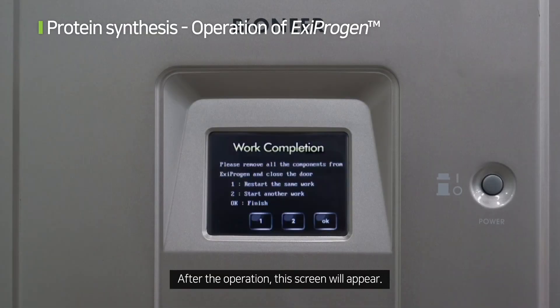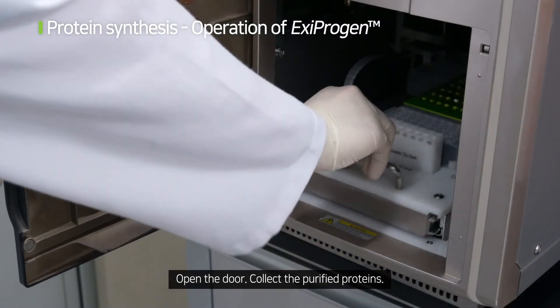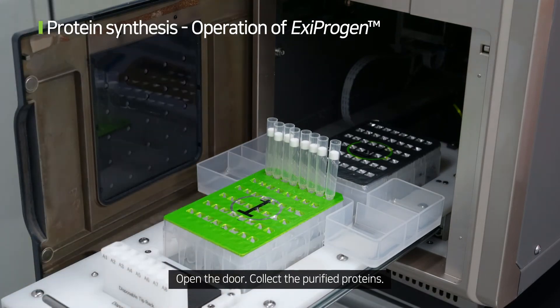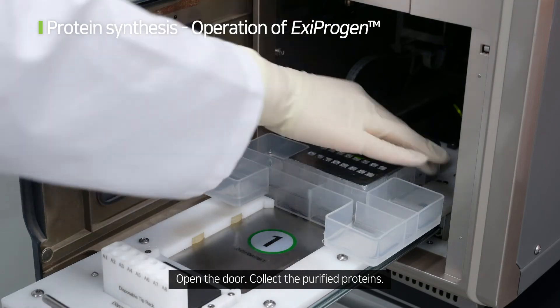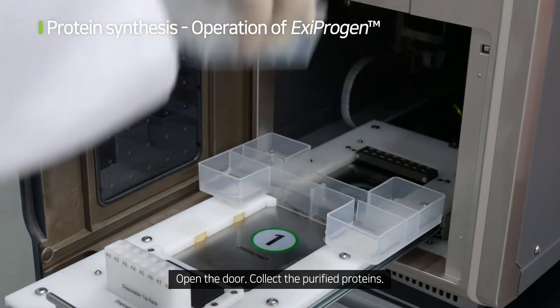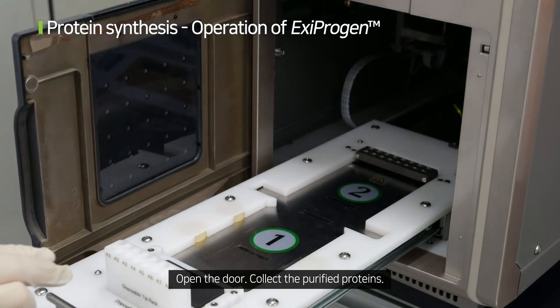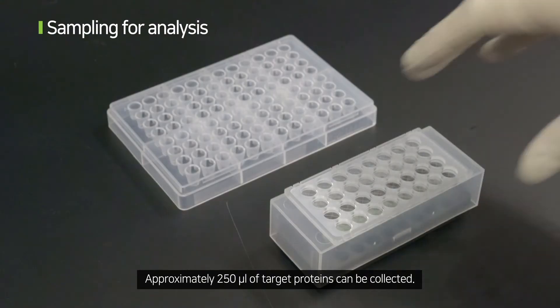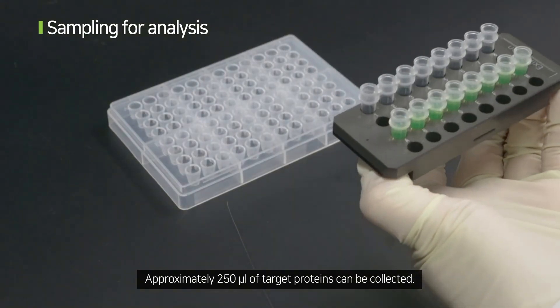After the operation, the completion screen will appear. Open the door and collect the purified proteins. Approximately 250 microlitres of target proteins can be collected.